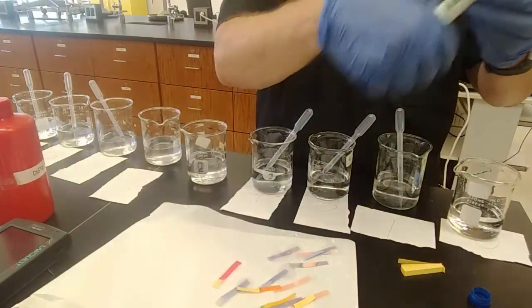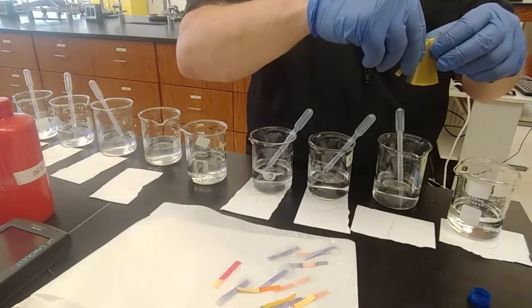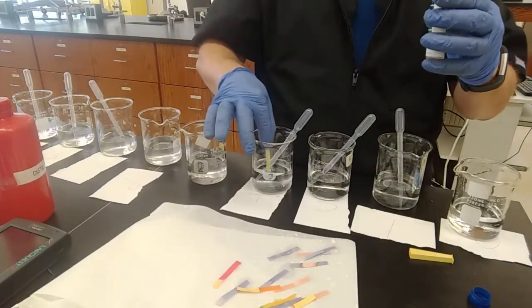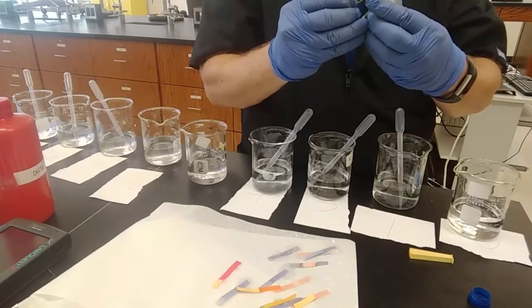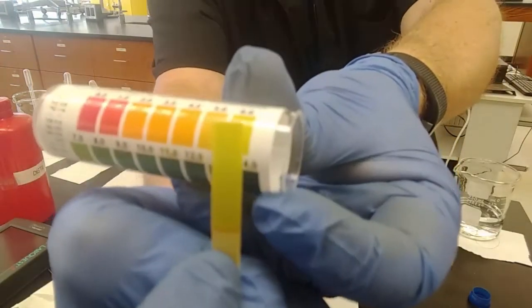Even though we were expecting a 3. Let's try 4. Let's see what we get. So we're all over the place comparing the meter, litmus, so on. So be it. That's why we check things different ways. Expecting a 4. Pretty clearly a 6 on here.